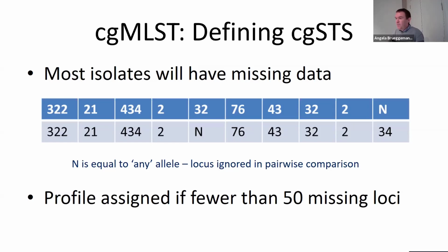But then when we wanted to cluster, it meant you couldn't cluster some of these isolates. So the pros and cons basically are, if you want to cluster everything, or as much as possible, then you need to allow things to have more than one core genome ST, possibly. It doesn't normally happen. Most things only have one, but it's just something to be aware of. Seeing 2 core genome STs doesn't mean that it's contaminated. It doesn't necessarily mean that. It can mean that. But it can just mean that there's other profiles that are similar, but that have been defined that are missing some loci.